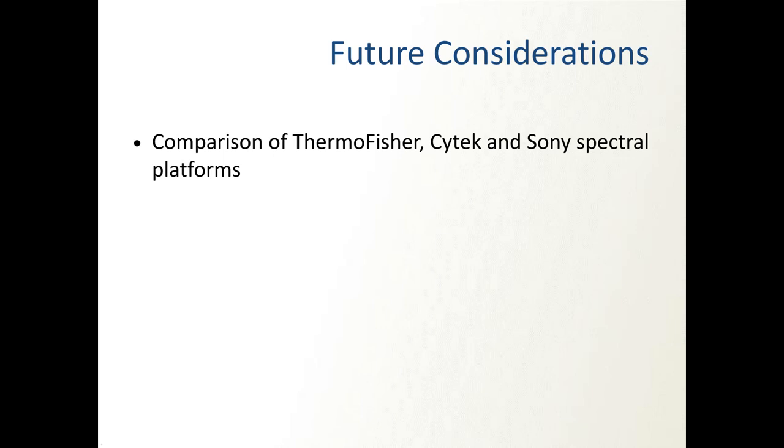The amount of effort and resources it takes to compare these things is really limiting. There's not that many places that have more than one of each of those three systems, let alone three of them. So the idea of a great cross comparison, where we can do one experiment and look at it in all three platforms and then debate the nuances in the unmixing algorithms, is where we're going to be going forward.